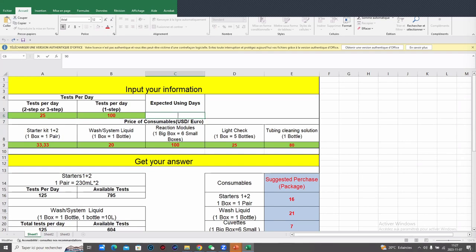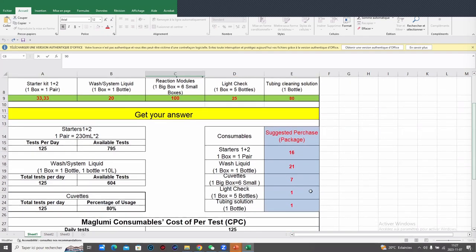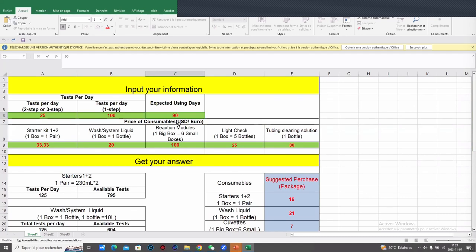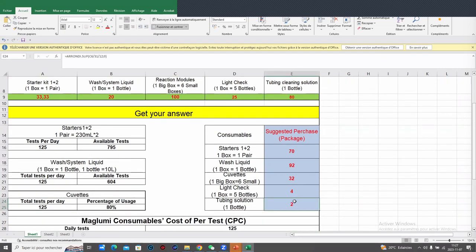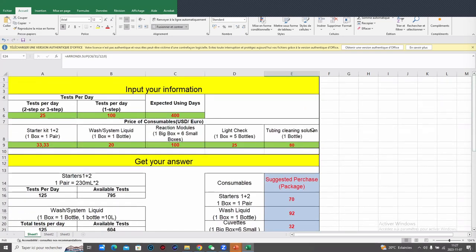So it will stay here, even if we change the throughput, until we exceed 1 year, for example 400 days. Then it will change to 2 because of the second year. This is for 1 pipettor. For 2 pipettors, it's 6 months. And it's just an estimation, but it is close to the reality. Any other question?